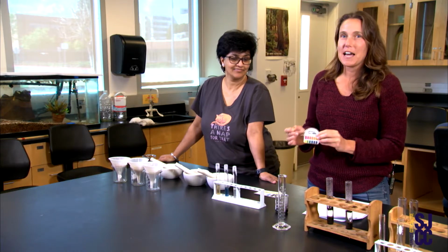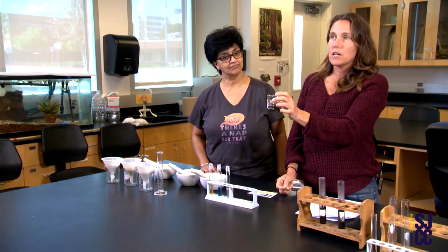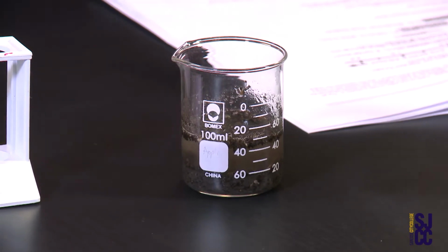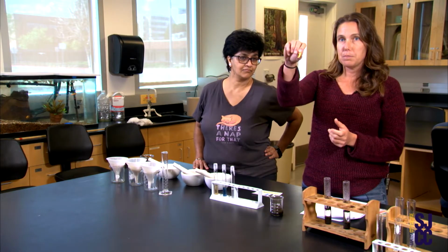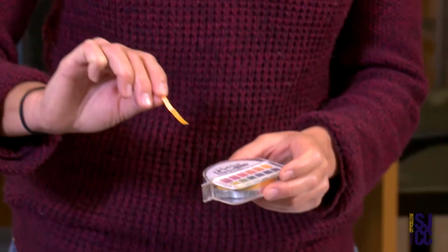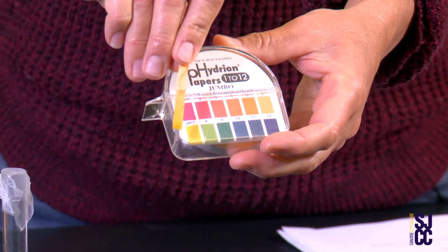So we are going to do the test. We took deionized or distilled water. We put 30 milliliters of this. The reason why we used distilled water is because it's a pH of 7, which means it's neutral. We put the soil in it to basically separate and get into the water, saturate. And what we're going to do is take a pH strip and dip it into the water for about a couple seconds. And then you just come back and look at the color of the pH strip and what it matches.